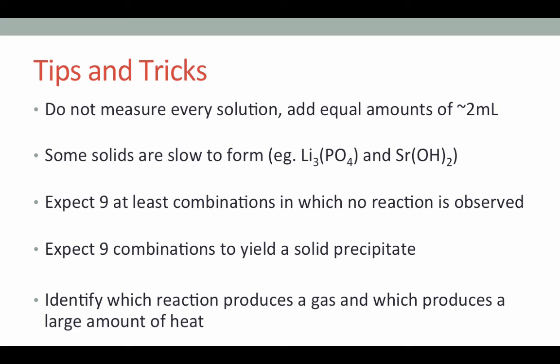Remember that in today's lab you will be working with sodium hydroxide, sulfuric acid, and other harmful solutions, so make sure that you are wearing gloves as well as your lab coat and goggles for best safety practices. The amount of heat that will be formed in the reaction is not enough to burn you, nor will the bubbles formed be so violent that they spill out of the tube. However, it's best to keep aware of your surroundings and try to minimize spills and tube breakage.